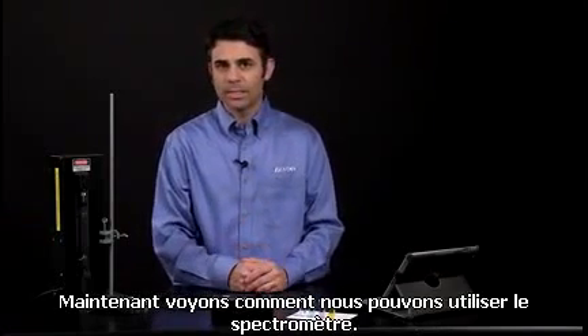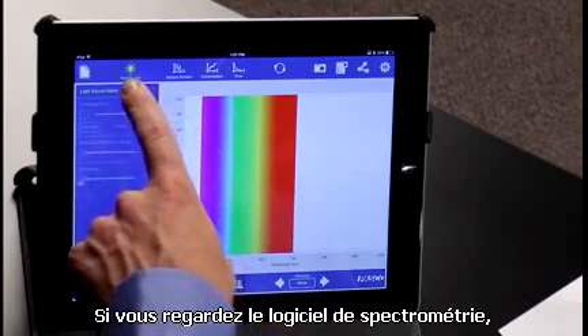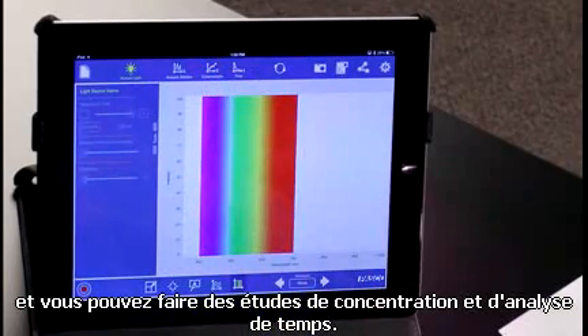Let's dive in and see how we can use the spectrometer. If you look at the spectrometry software, you can analyze lights, you can analyze solutions, and you can do concentration and time analysis studies.